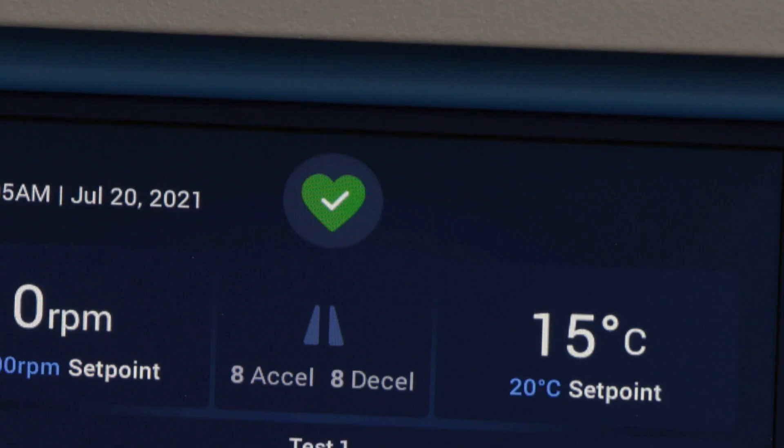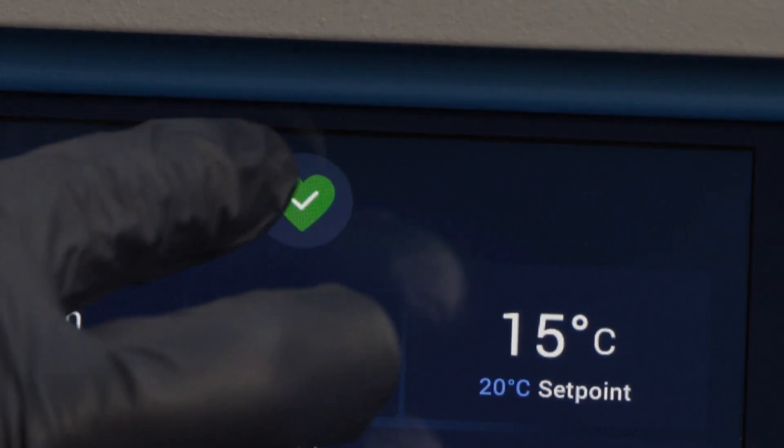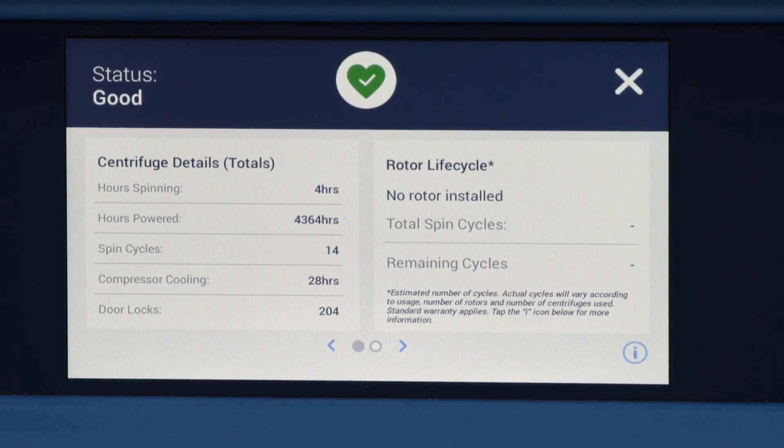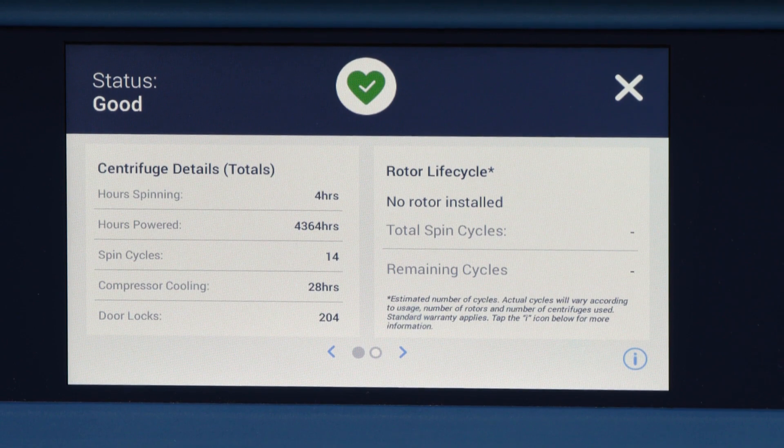See the health button that shows the current status of the centrifuge and rotor. This helps the user quickly identify the readiness of the unit, access rotor status, and alarm information, preventing any unexpected downtime.